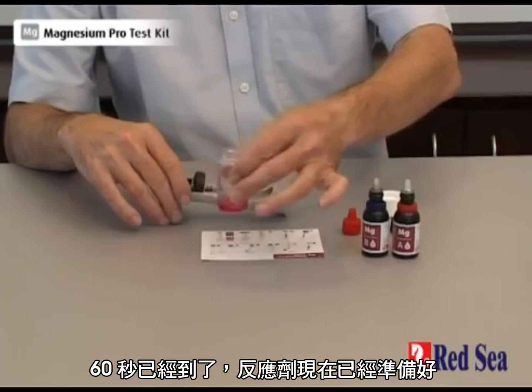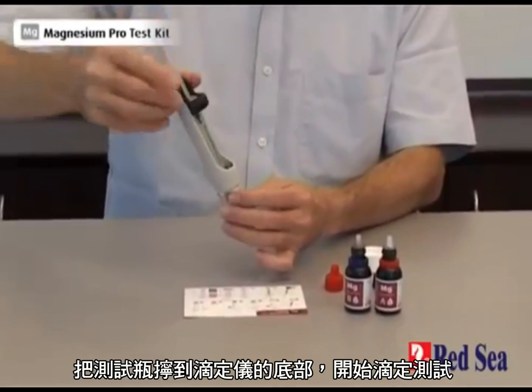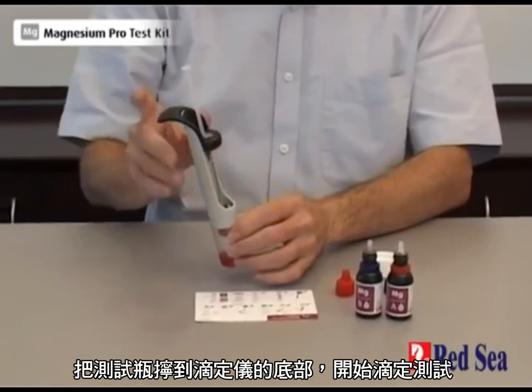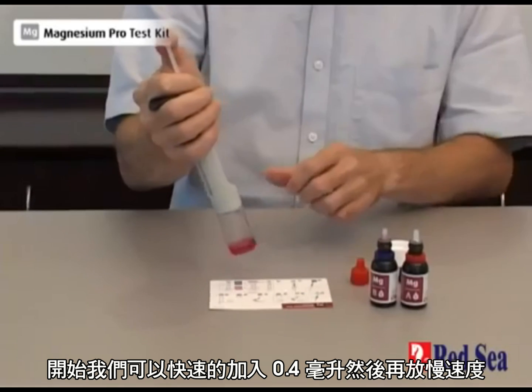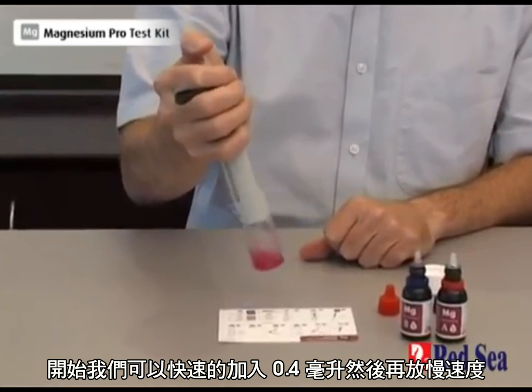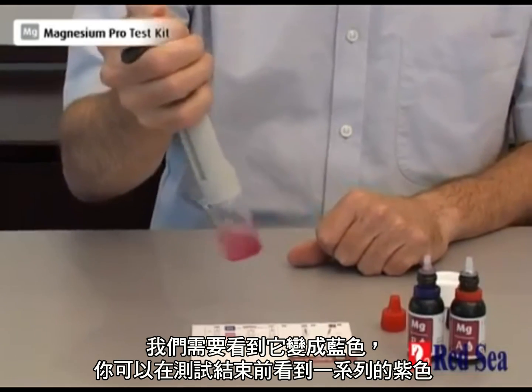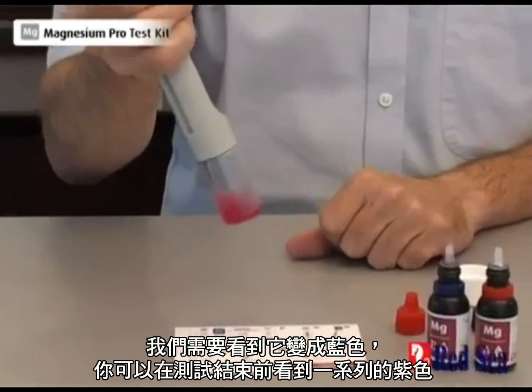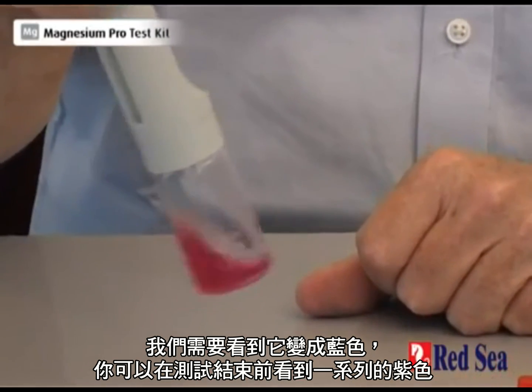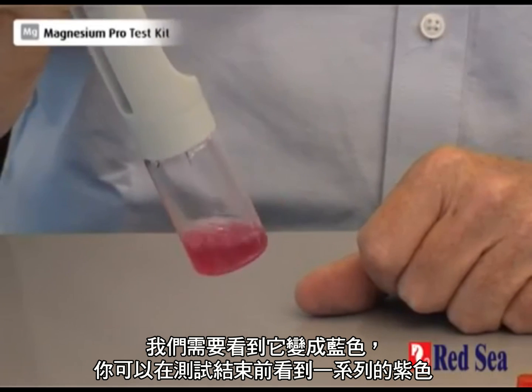That is our 60 seconds — the reaction is now ready. We screw it onto the bottom of the titrator and we start doing our titration. To begin with we can add about the first 0.4 of an ml very quickly, and thereafter we slow down. We are looking for the blue end color, and you'll see there's a series of purple colors that are indicating the end of the titration.